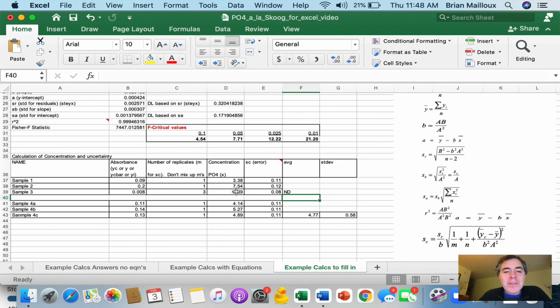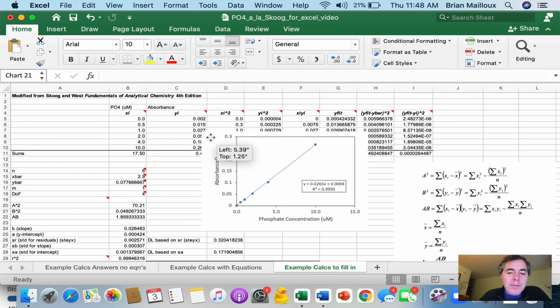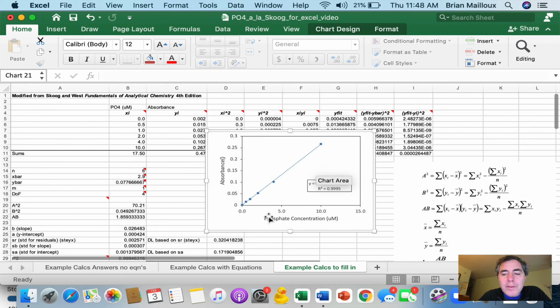Anyway, that was a ton. But if you look, we're going to go back and do this a much easier way. We have this amazing standard curve. You can calculate your concentrations. And this is sort of the hardest Excel we did. Look at these equations we added. And if you can do this, you can probably add almost any equation to Excel. Good luck.